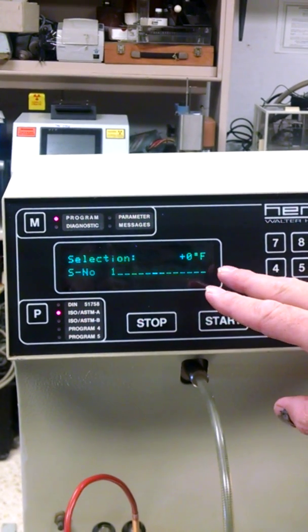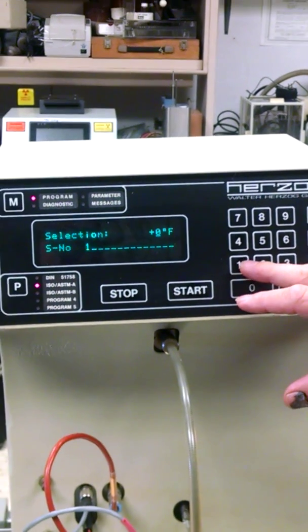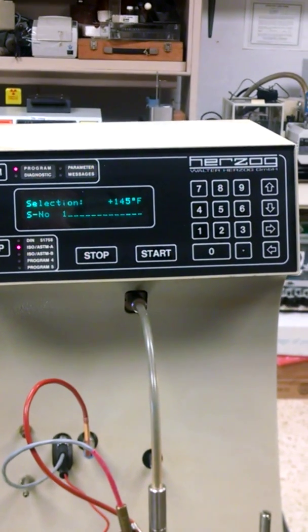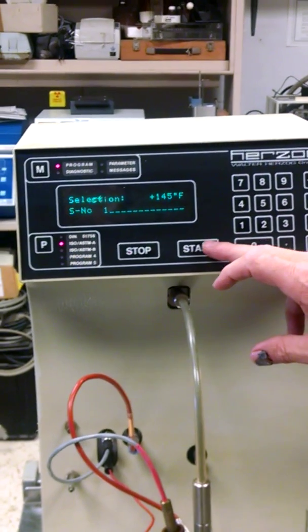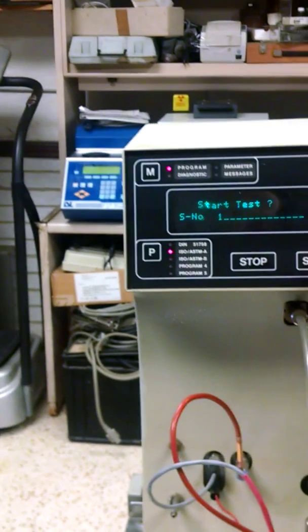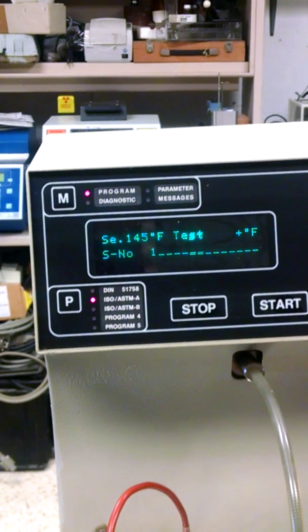Now it's going to ask for estimated flash point. I estimate this diesel to flash at 145 degrees Fahrenheit. So we put in 145 degrees Fahrenheit and we hit start. Now I ask do you want to start to test and you hit start again and yes and it'll start.